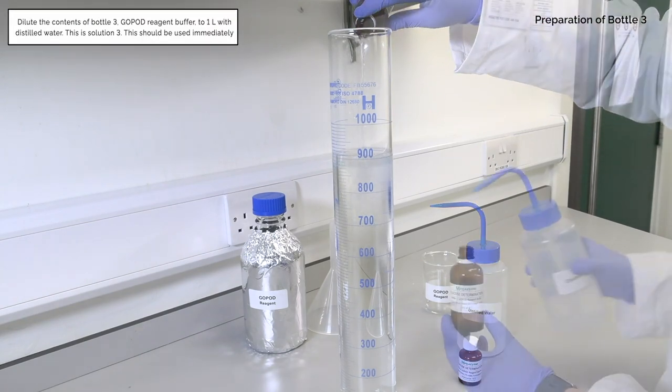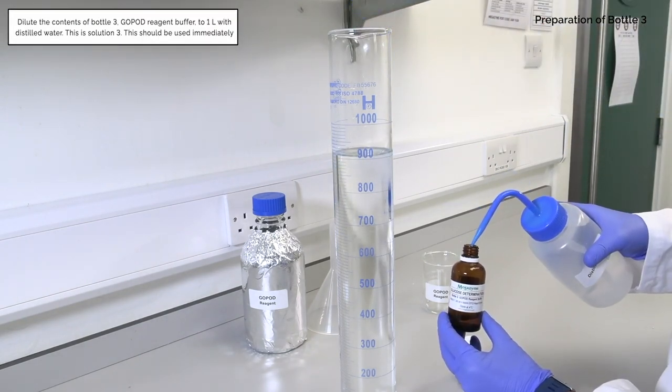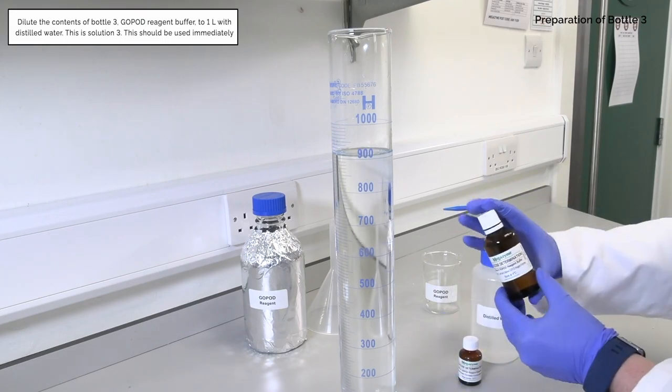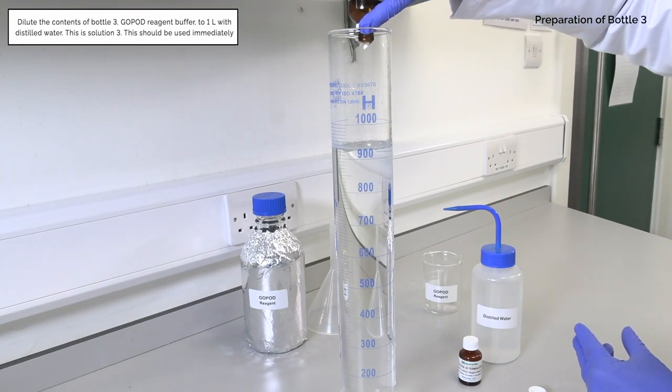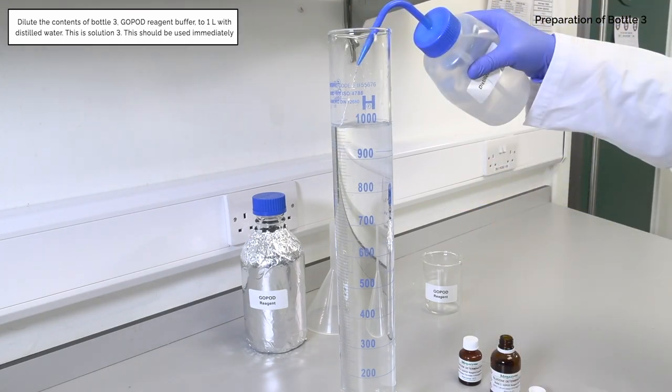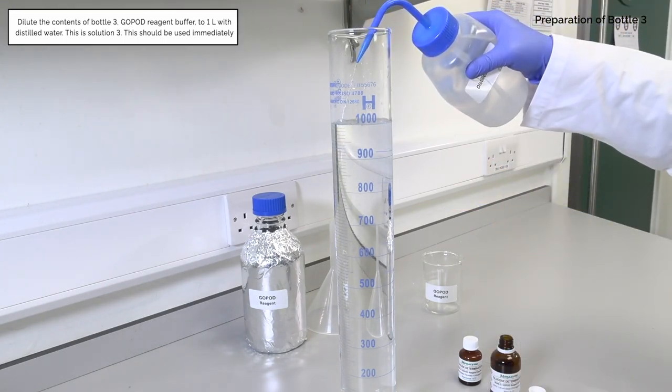Dilute the contents of bottle 3, GOPOD reagent buffer, to 1 liter with distilled water. This is solution 3. This should be used immediately.